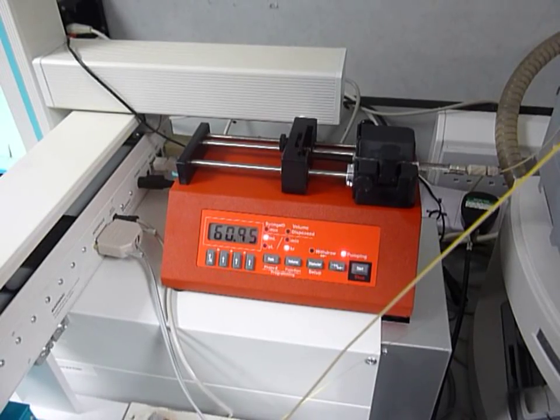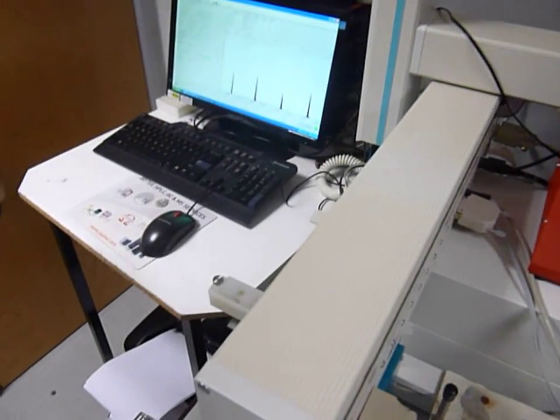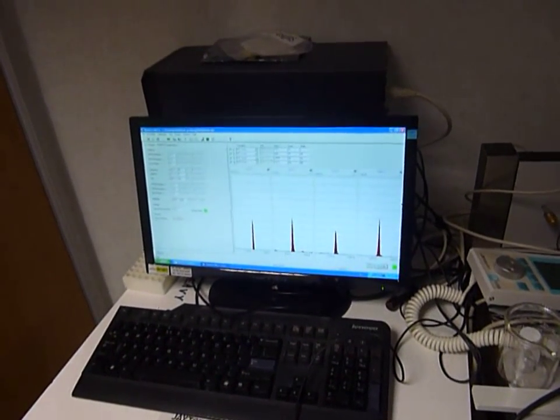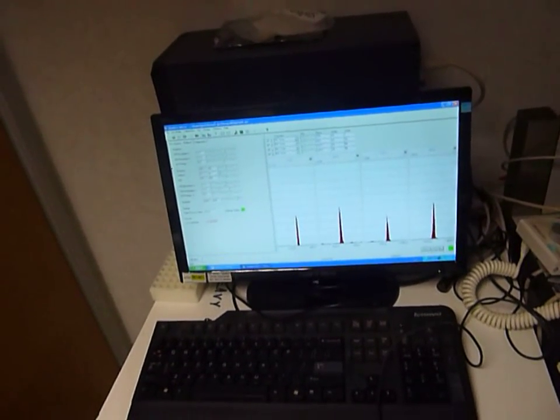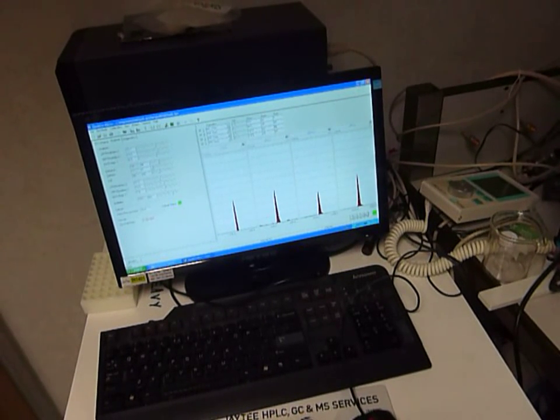And then it's now running and you can now see it infusing the sodium iodide into the mass spectrometer. Nice steady readings of the NAI polymers.